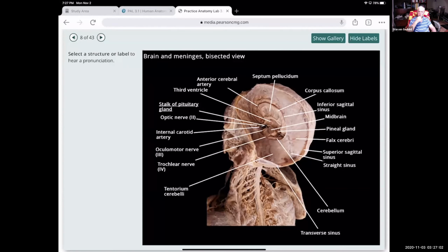Remember, you don't see the pituitary gland because what's the bone? You see where the pituitary gland is connected. What's the bone that encases the pituitary gland? If you don't dissect it out by removing bone, you pull the brain out and the pituitary gland is left, it's separated. What's that bone? Sella turcica, perfect. That surrounds the pituitary gland and allows protection of it.